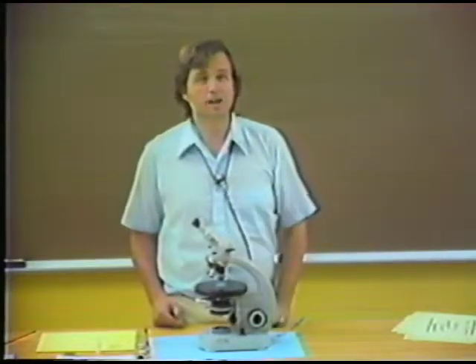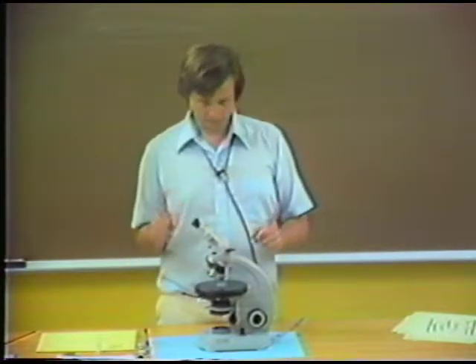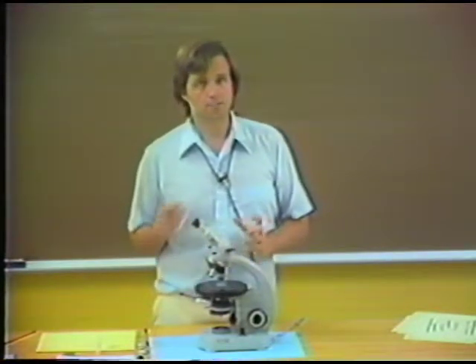Since light in an isotropic mineral travels the same speed in all directions, then we can describe its optics by one unique refractive index. And this mineral is isotropic. It has one refractive index. And now we know that this refractive index is between 1.478 and 1.576. And indeed, we know also that it is closer to 1.478 by our observations.